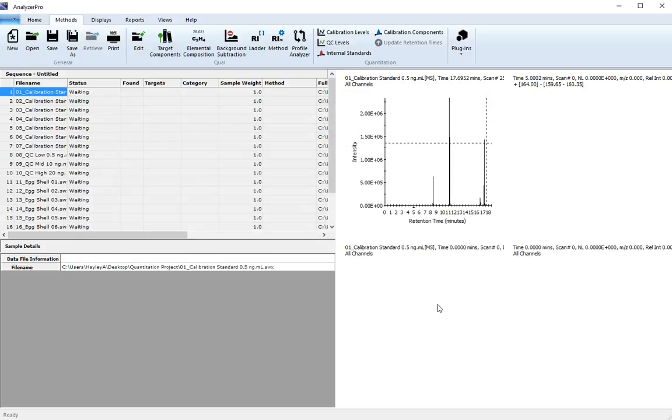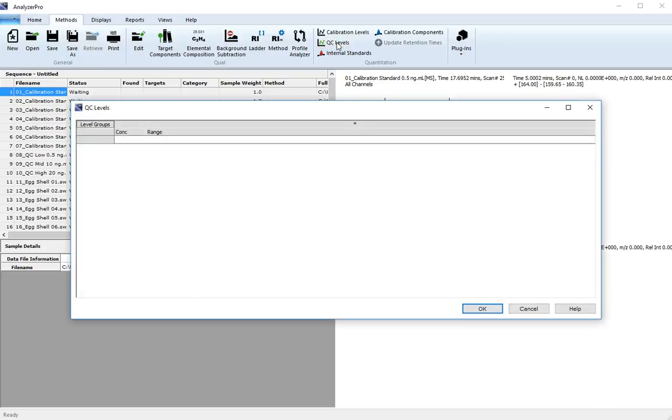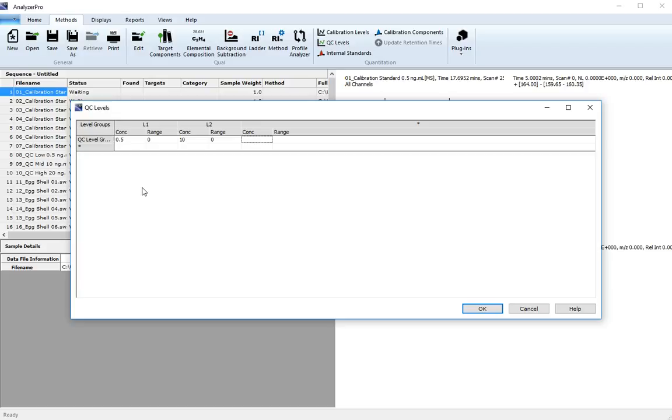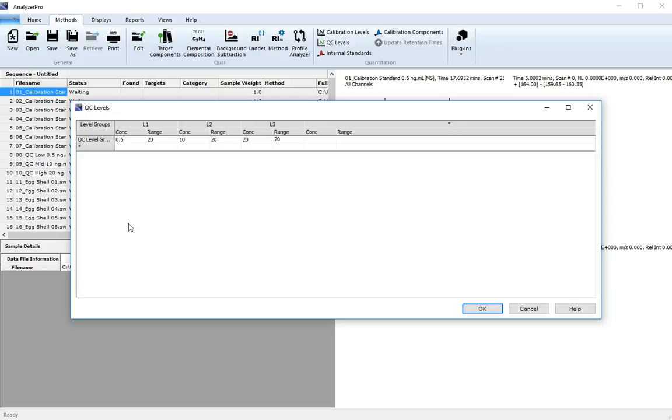And then move on to define your QC levels. Similarly, we can use a single group here. We're going to use a low, mid, and high QC level. Click OK. Here we need to also define an acceptable percent range for the QC sample to pass. Click OK.